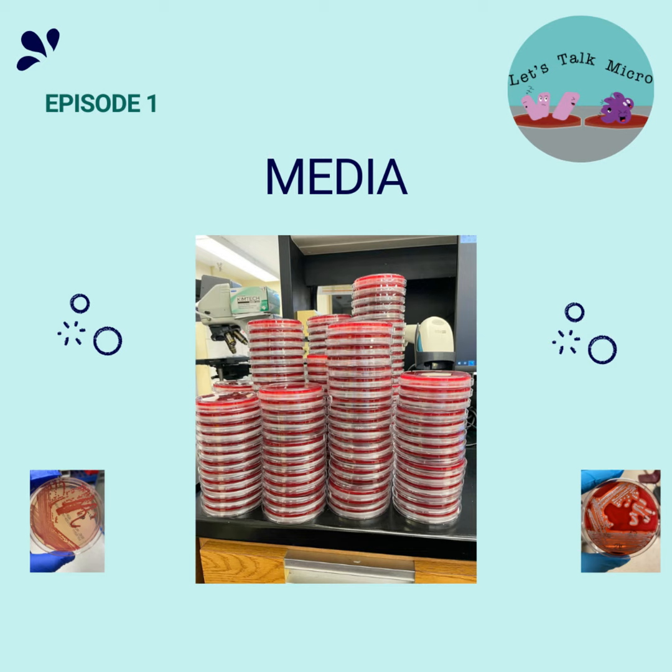A great example of this media is blood agar. Every student in basic micro, when you get started in the lab, you work with blood agar, right? So when I'm talking about blood agar, everyone knows what I'm saying, basically. It has sheep red blood cells, and it is definitely one of the main agars that we use in cultures. I will say that almost every culture panel includes blood agar.